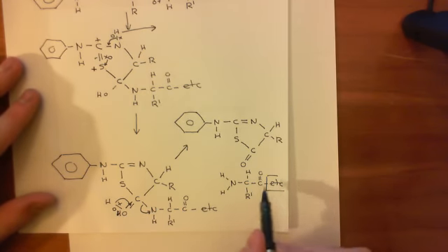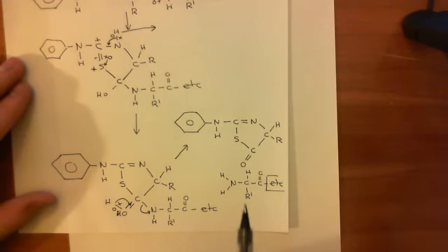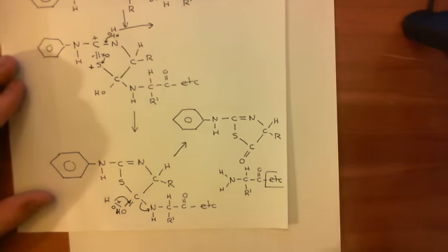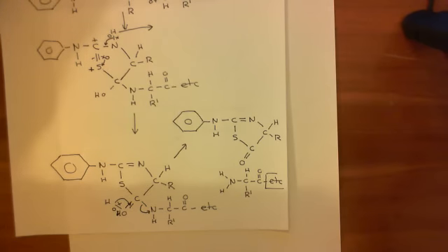So you can then do Edman degradation again to work out what the third amino acid is, and you can continue this process, doing this reaction over and over again, and find out what each of the amino acids is in the polypeptide, and that way you can sequence your polypeptide. You can find the sequence of amino acids that comprises it. Okay, so that is Edman degradation, and as you can see, it is a method for analysing what the amino acid sequence of a polypeptide is.